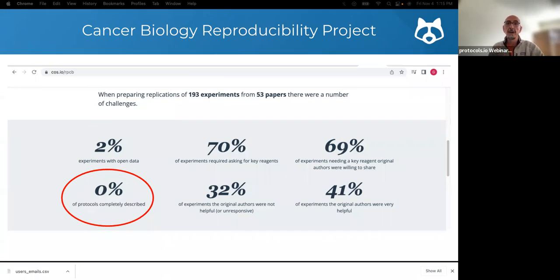This is caused, among other reasons, because people move from labs. For example, students graduate and leave, postdoctoral researchers become faculty elsewhere, and so on. And it's also not uncommon that a physical paper lab notebook gets lost, misplaced, or is damaged. Therefore, we thought that a system for the proper storage and exchange of detailed experimental protocols was needed.